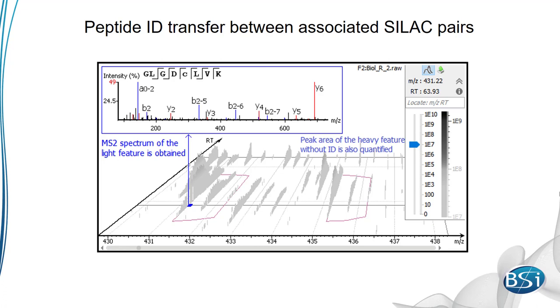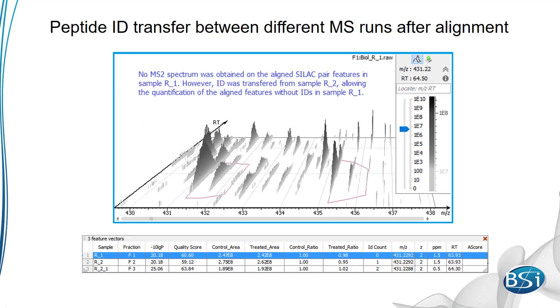Also, ID transfer can be done across samples. Here, replicate 1 doesn't have an MSMS spectrum associated with it. But replicate 2 does. By aligning the retention time of the peptide feature pairs between the replicates, the ID from replicate 2 is transferred to replicate 1. So, quantification can still be performed on replicate 1, and a missing value is avoided.